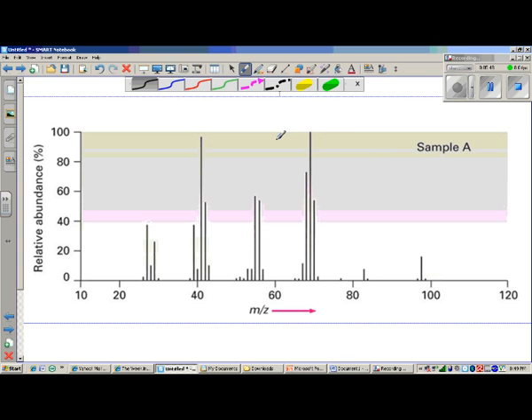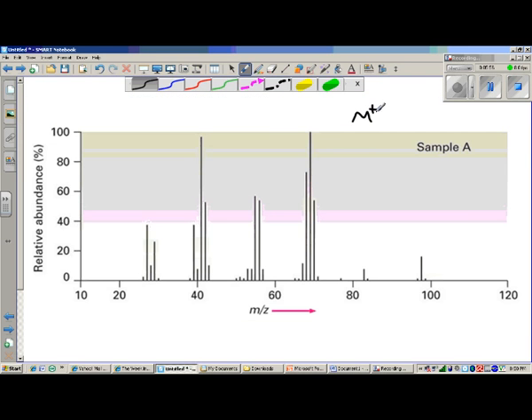This is an example of a typical mass spectrum. And usually the M+ peak, the molecular ion peak, is the peak that's furthest to the right in the spectrum, because the scale increases in size here. This is a size to charge ratio, implying the charge is +1.